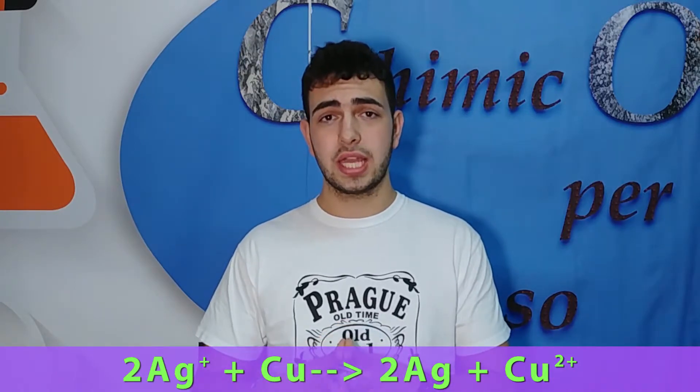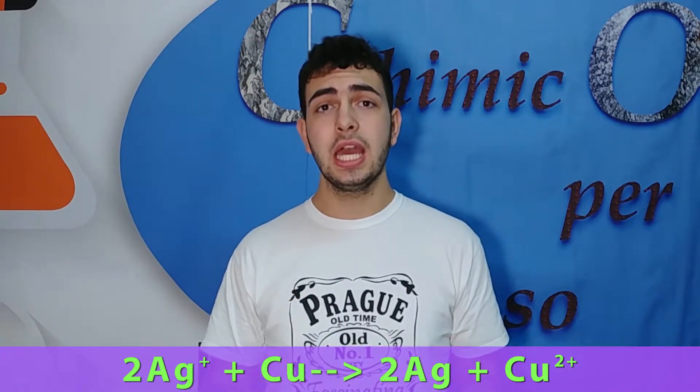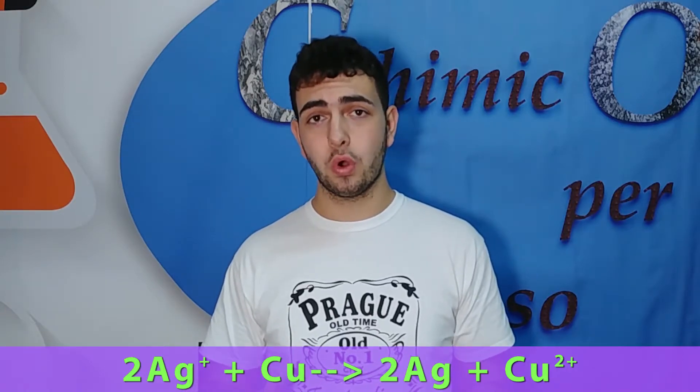When this reaction happens we can gain metallic silver in powder form. In order to obtain it in a really crystalline form, we have to melt it with heating and after that cool it down in order to get a stronger composition of our silver.